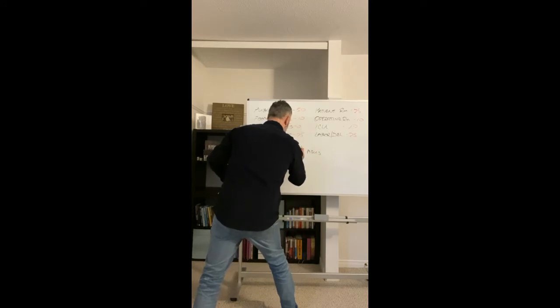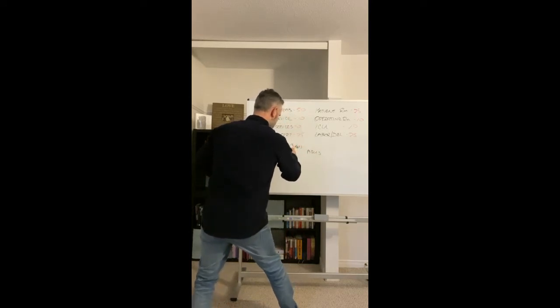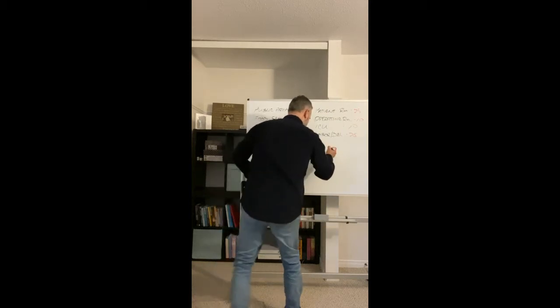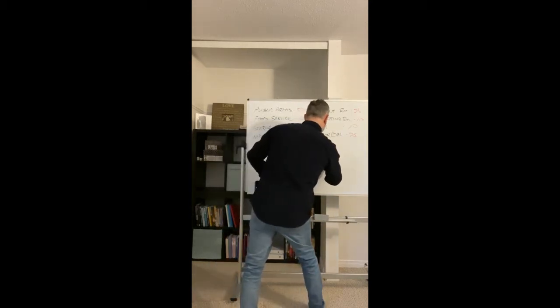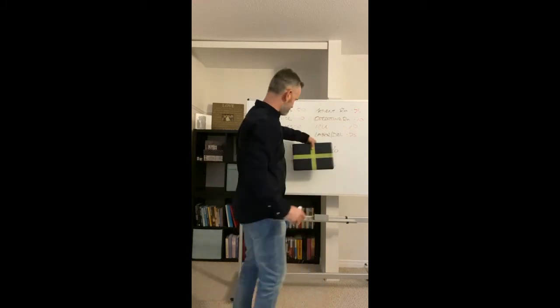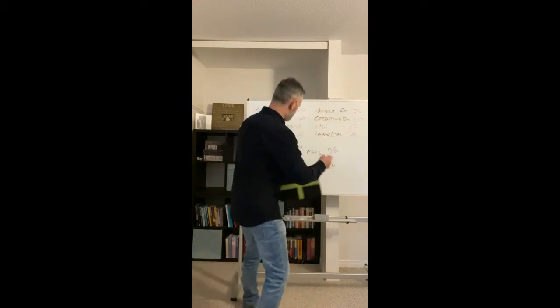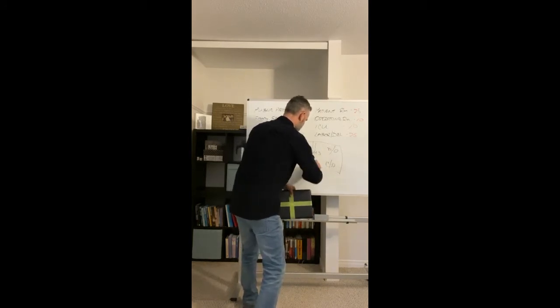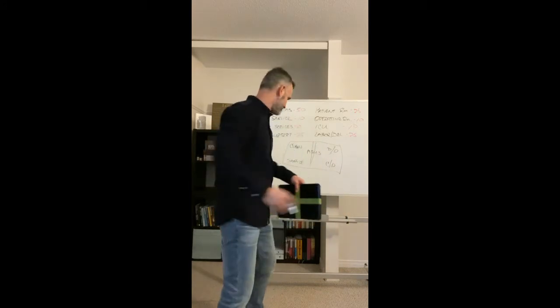Oops. Wow. Come on, Kevin. We're going to do clean. We're going to do sanitize. Sanitize. Wow, I really can't write under pressure here. We're going to do disinfect. Here, I'll just abbreviate that. Disinfect only, and we're going to do clean and disinfect. So the areas are basically split up like this. Sorry, that's terrible drawing, but hopefully that makes sense.